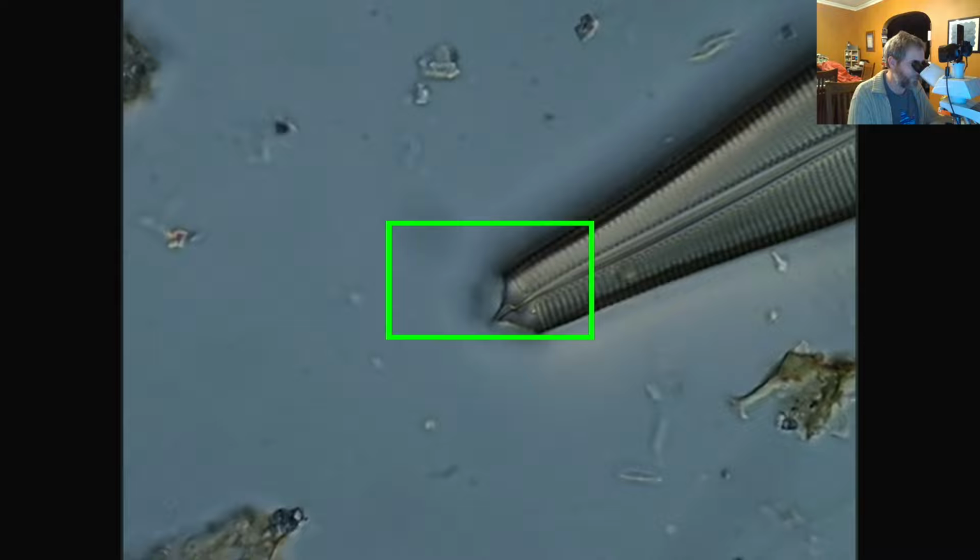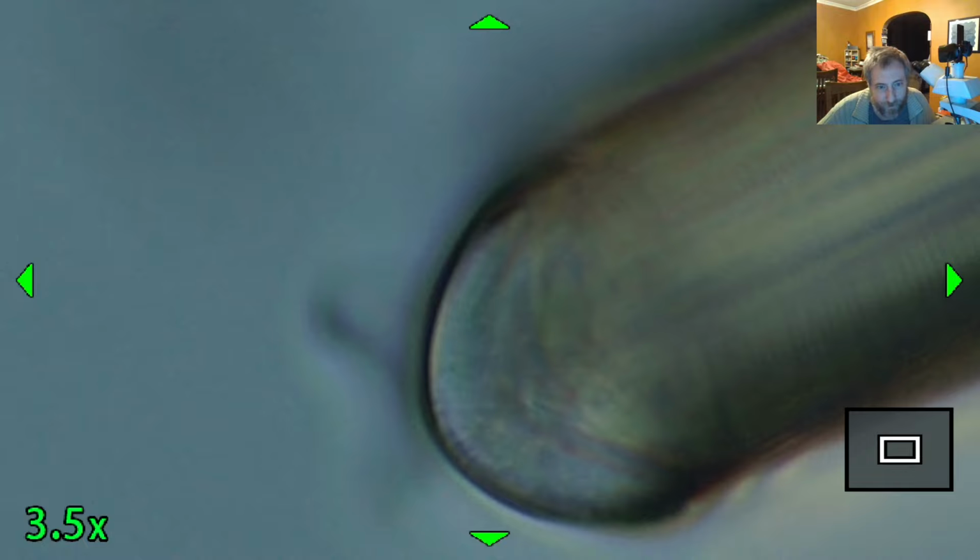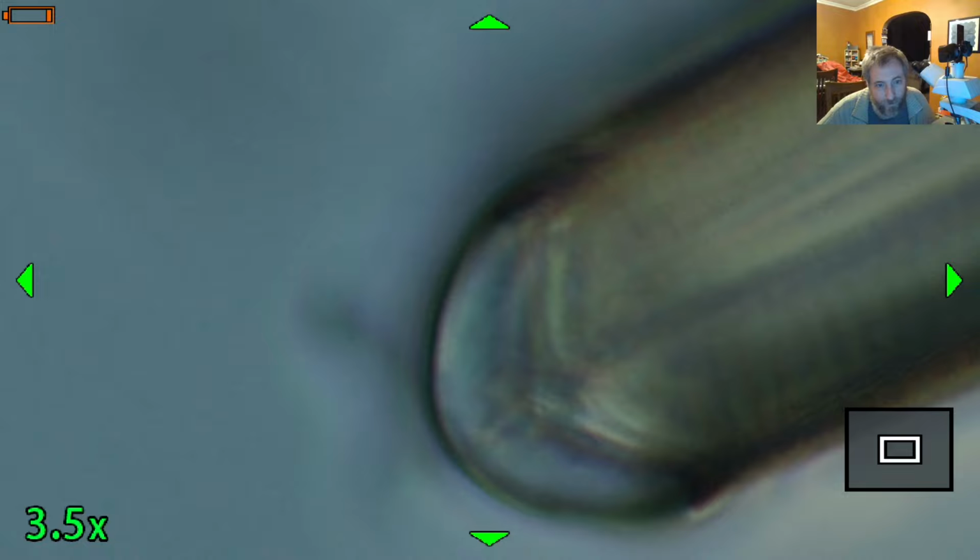In the light microscopes, you're never going to see them really. I can get you closer, but it doesn't mean you're going to resolve it any better because the wavelength of light is kind of restricted. But you can kind of see them right there. See the little tiny holes? That's about as good as you're going to get. We're super zoomed in on a really good microscope. But the scanning electron microscope will be able to see those very clearly. Yeah, you can see them.